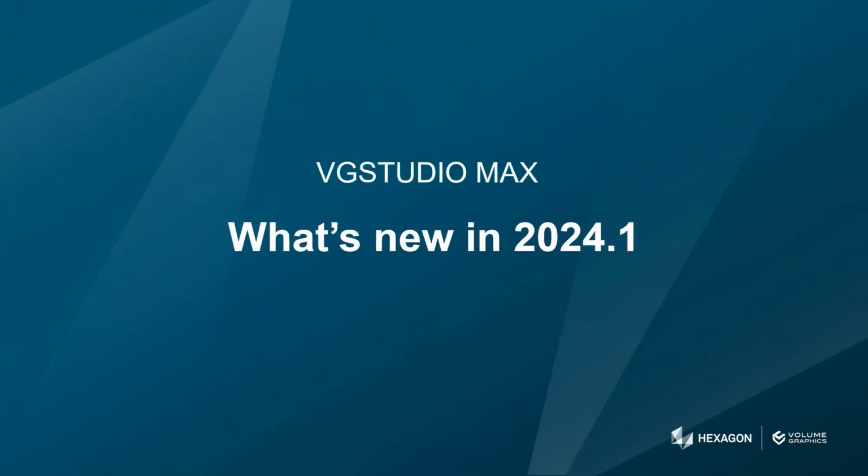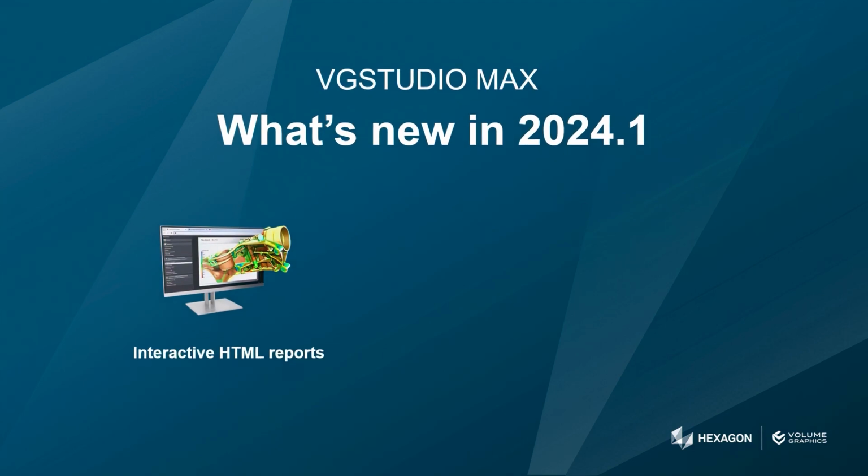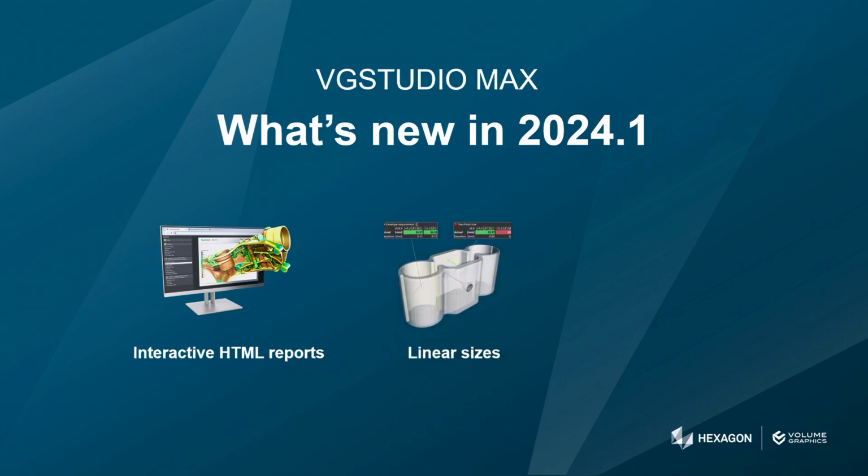With our latest release, we have added a host of new features that will make your work much easier, like interactive HTML reports. Enjoy the full power of our reports on any computer with a standard web browser. Reports to go. We have also made the standard compliant creation of linear sizes much easier and more convenient, drastically shortening the path from measurement plan to analyze scan.